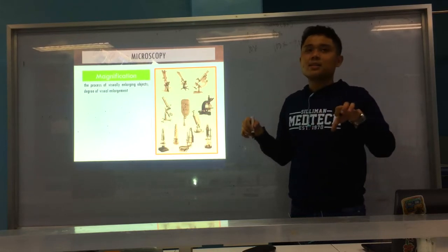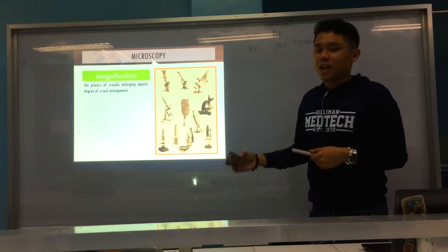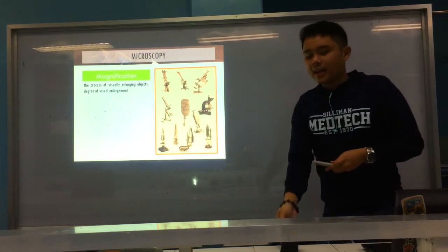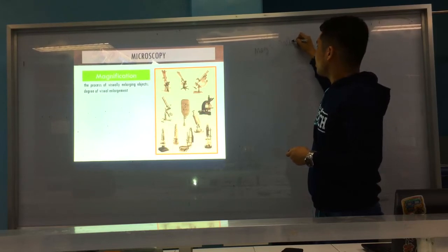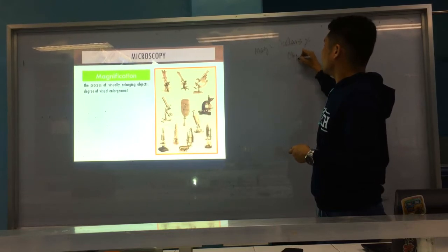Usually in the book they explain that's total magnification. But the point again about total magnification is that it's the ocular magnification, the oculars times the objective magnification. Basic, it's a review.